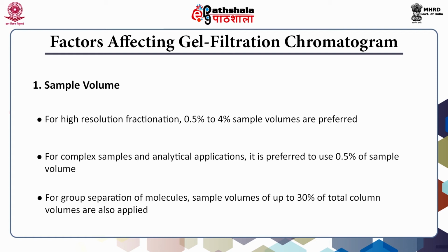On the contrary, for group separation of molecules, sample volumes of up to 30% of total column volume were also applied. So, depending upon the type of experiment, we can think about the column sample volumes. But in general, a sample volume of 0.5 to 4% is preferred.